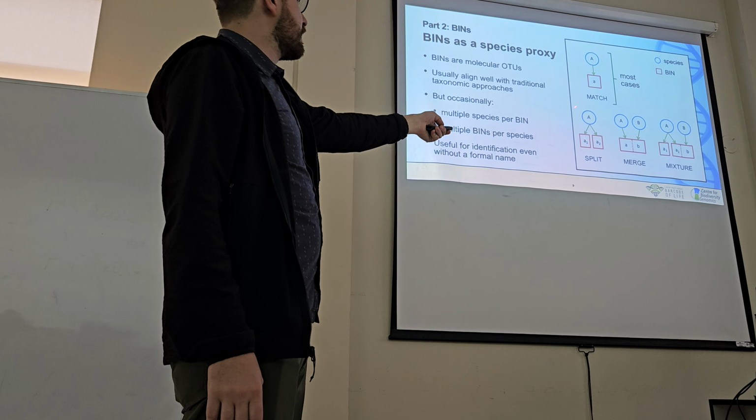You can see here some photos, mostly butterflies. Pretty nice. So if you click, for example, the taxon, the bin name, you can see who identified it, who collected it, and the country, so Juan Dorados in 2017.